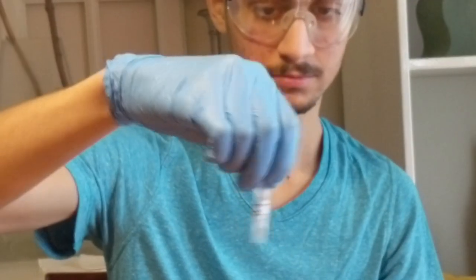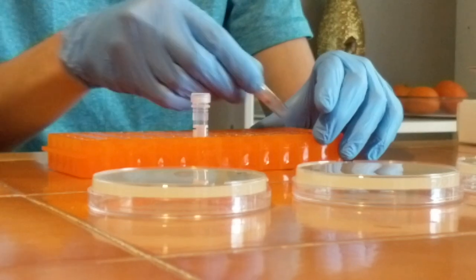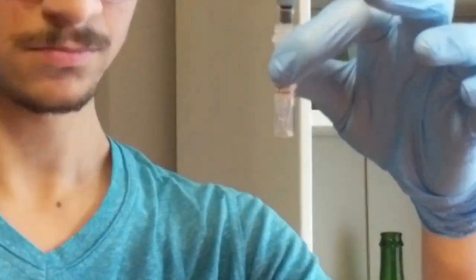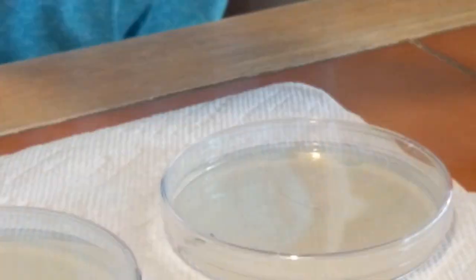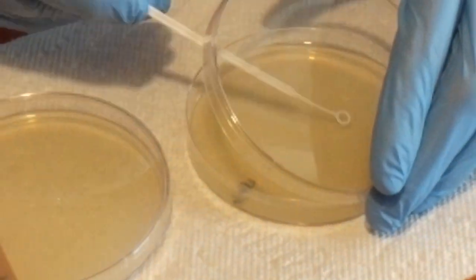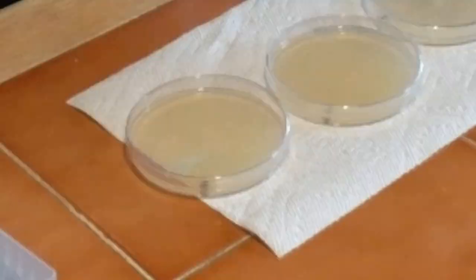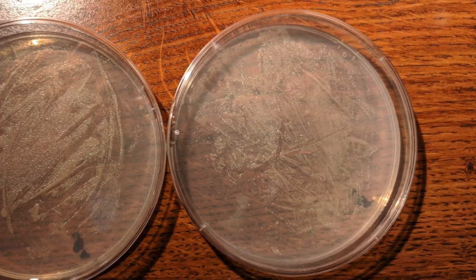I used some distilled water to suspend some freeze-dried bacteria, and I stroked this tube across my rack to mix it well. Then I pipetted some bacteria from the tube and inserted them onto the plates I had prepared the night before. I took my inoculation loop and spread the bacteria around in the plate. I left these plates in my room for about a week and this was what I found.